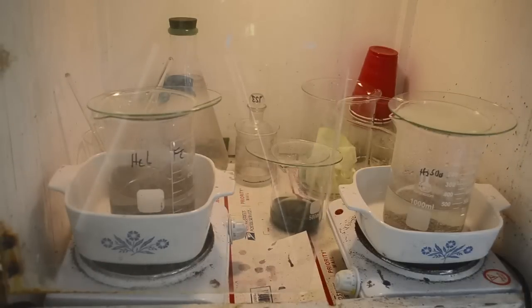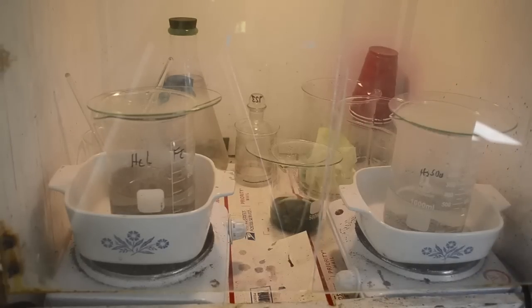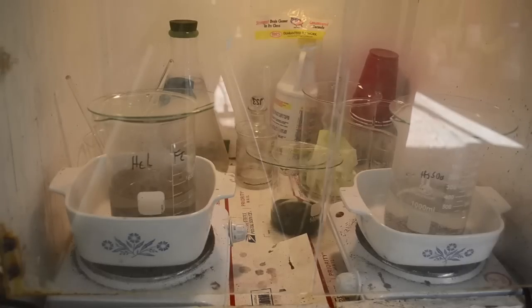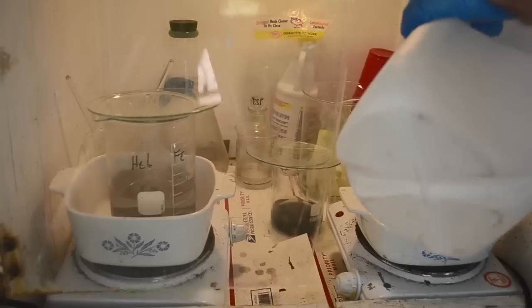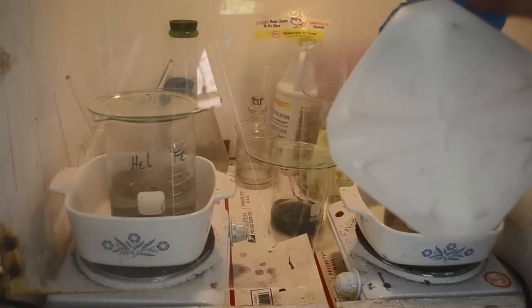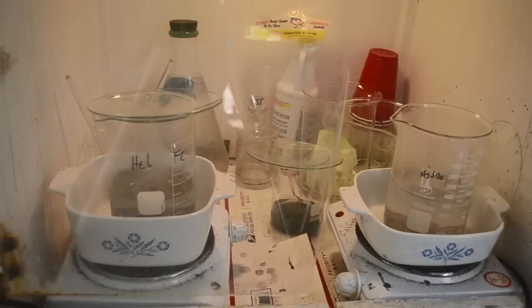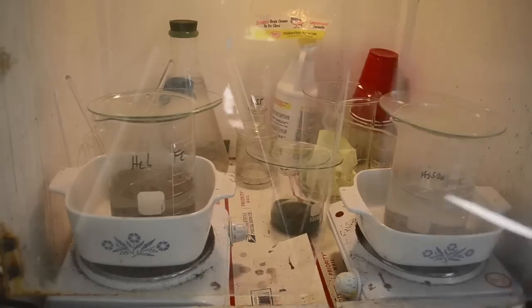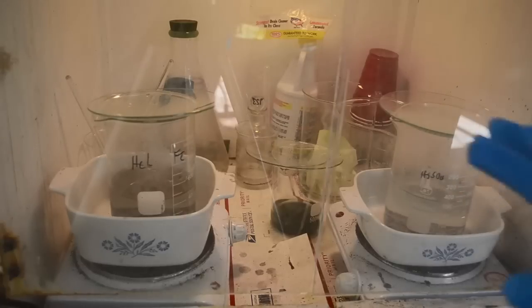So they're both stone cold, so this is going to take a while. That one's a little warmer after dumping the acid in. Well, I just had a thought. I'm only getting my 10% concentration if I top this off to a full 500 milliliters like I did over there with the other one. Otherwise it's a little more concentrated than I was aiming for. So okay, now we're about where I want it. Let's let it continue to heat up.